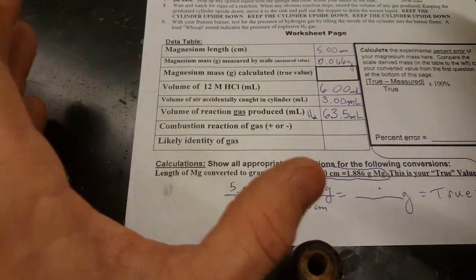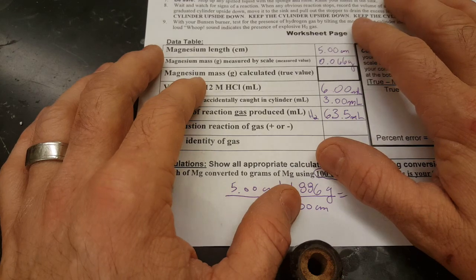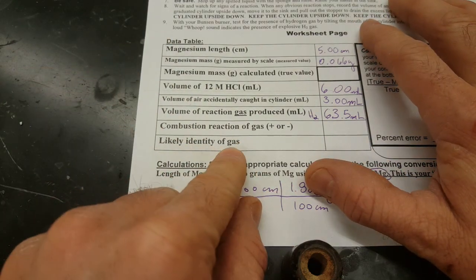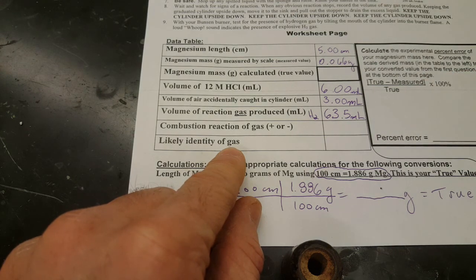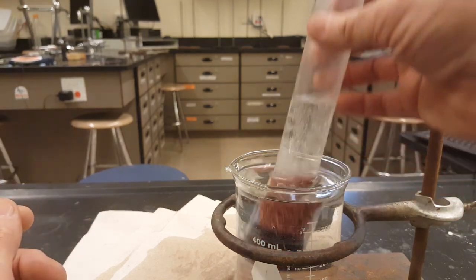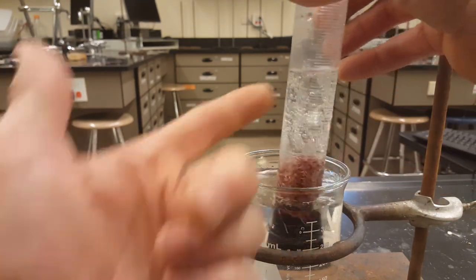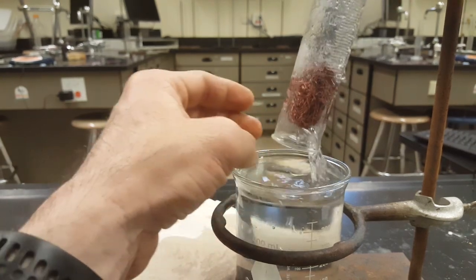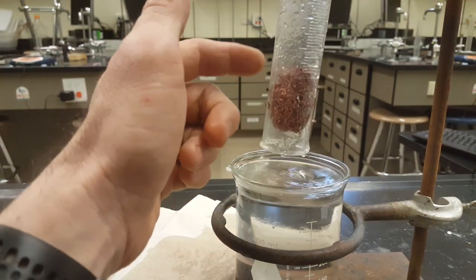All right. Right now, you have all the data that you need from the experiment except for proving that it's hydrogen gas. I'll show you how to do this final test, and then the rest of this lab is answering questions and doing calculations. Let's start with the removal of the graduated cylinder. You've already taken your final measurement, and so you can drain everything back in, but this is really key.